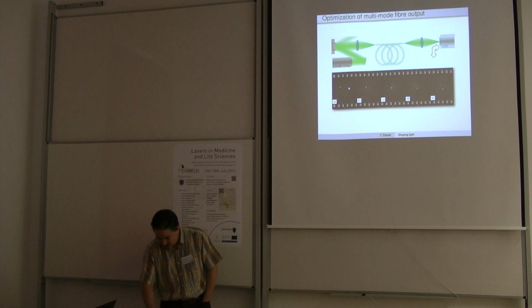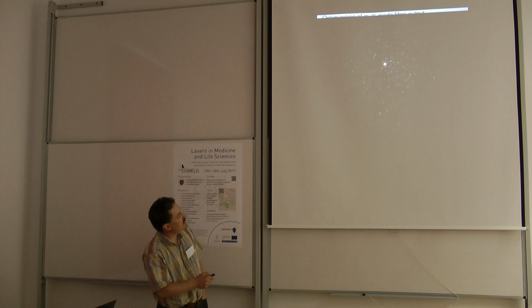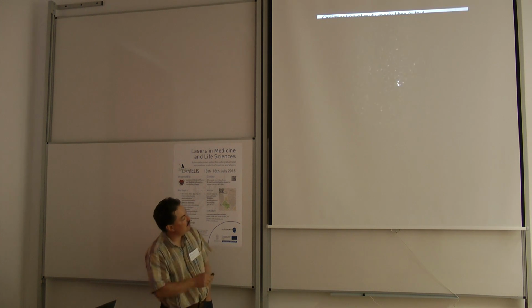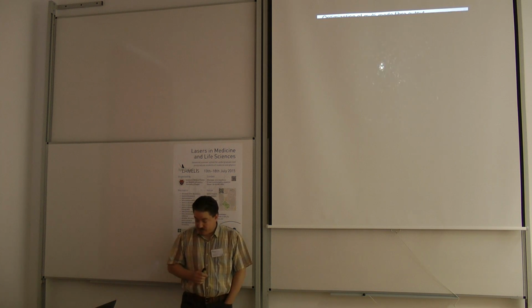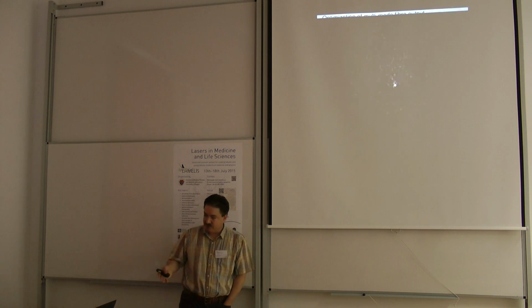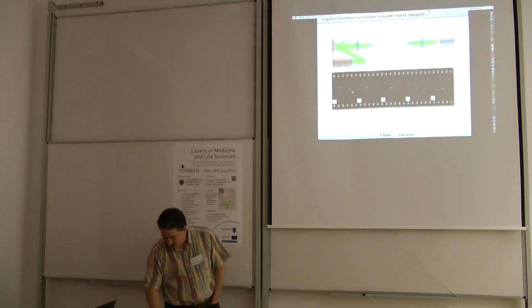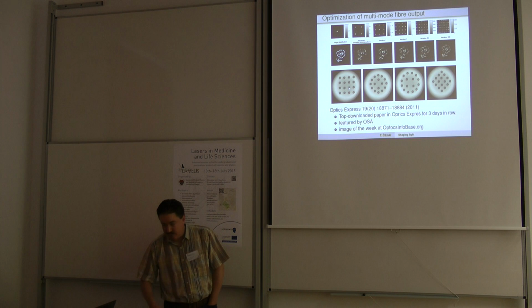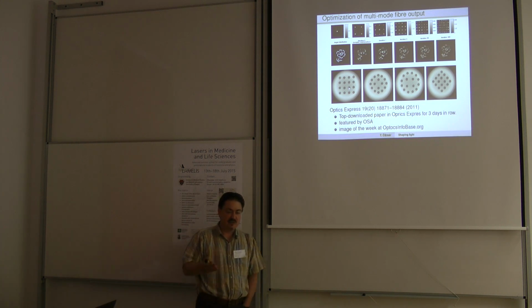So already somewhere in 2009, I have done the experiments on the focusing. So you can see I'm sort of changing the point at the end of the multimode fiber. Unfortunately, this was never published because I was recommended when I submitted this as a part of my first Nature Photonics paper that I should rename it. So I did that. We don't argue with the editors. But the problem was you could see that there was a lot of background behind the point, a lot of scattering light that would negatively influence the imaging.